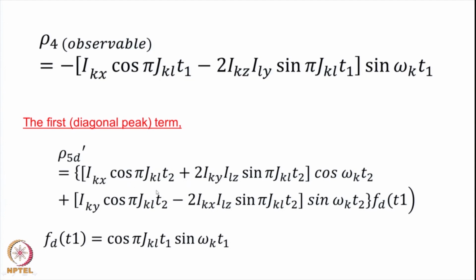Okay. So, now if you look at this in a little bit more detail, you can choose one of these to say we are going to record Y magnetization or the X magnetization. So, you can choose one of those for demonstrating the principles. Now, in either case, I have here cosine cosine and here cosine sine in the T2 period, cosine cosine and this is cosine sine in the KYLZ.